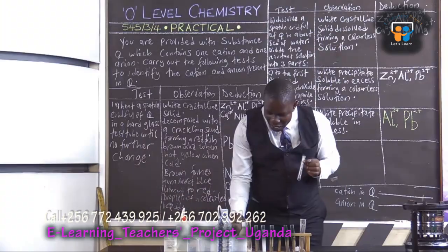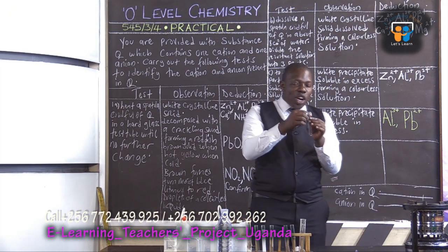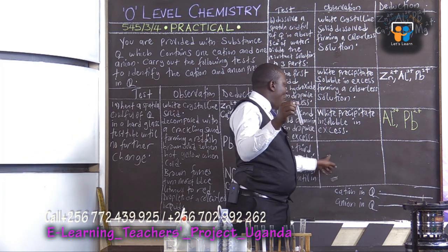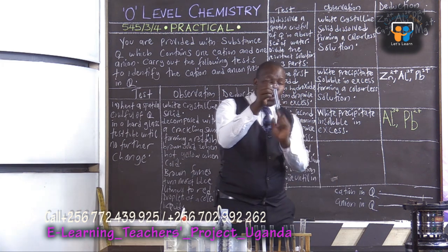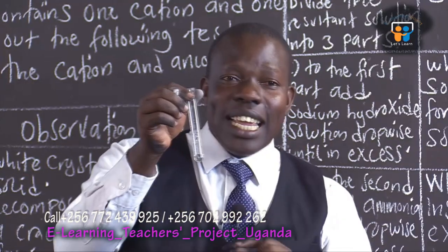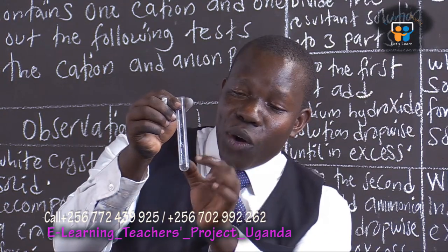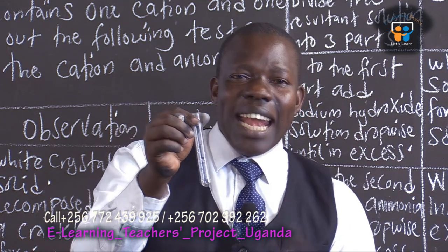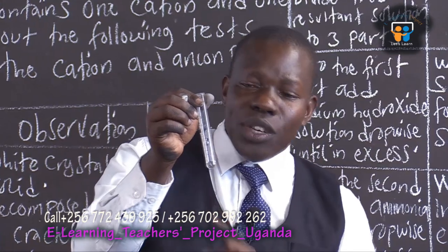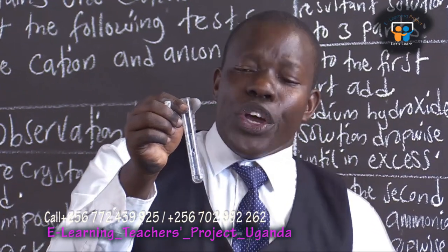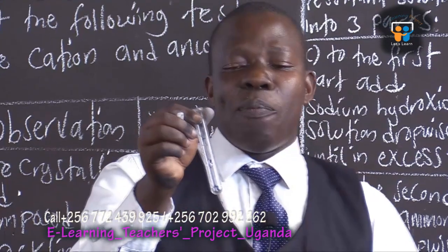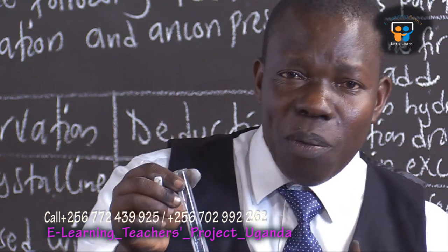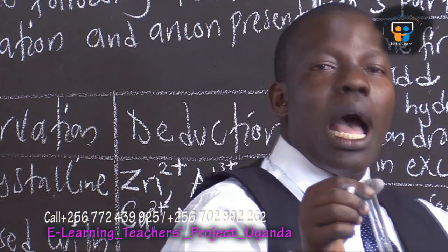Now, to give you a hint about what we actually expect: should we add potassium iodide and our solution remains colorless — like the one you're seeing inside the test tube — we shall confirm aluminium.